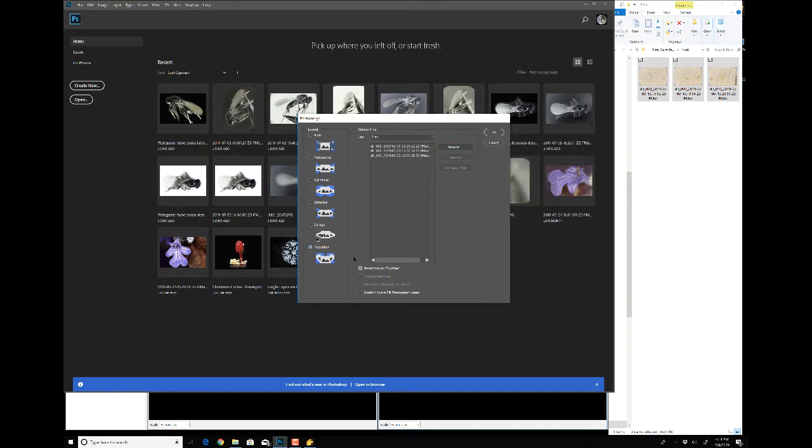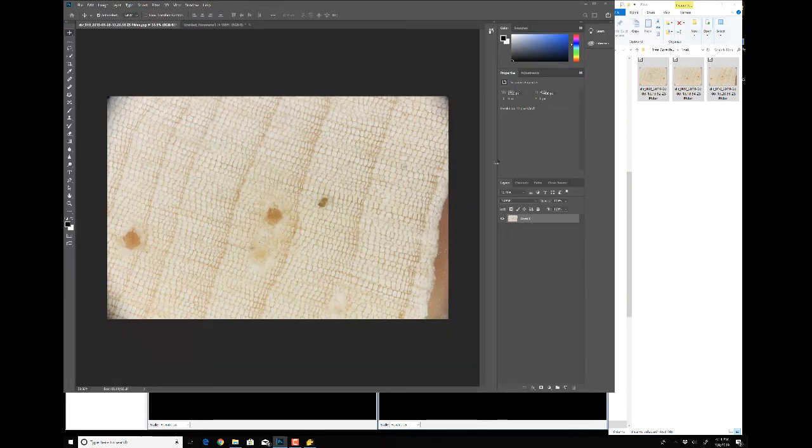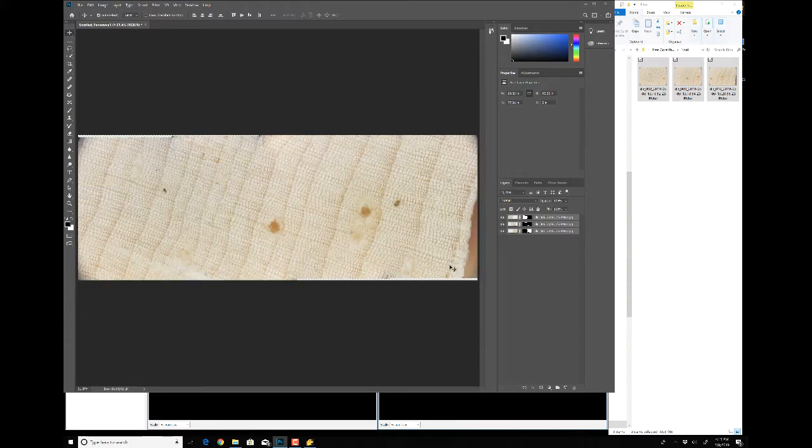So what you want to do is click on Reposition, press OK, and then what that's going to do is it's going to take all 3 of those photos, it's going to analyze them for consistent areas, so areas of overlap, and then it's going to generate a panoramic. Now you should be able to do this with all 65 frames, but if it doesn't work with all 65, if your computer isn't powerful enough, you can do it in batches. So do 5 frames at a time, then generate and save file output images, and then you want to stitch together those. So you can do it in pieces as well. But there you go. So now what you do is you have your panoramic.